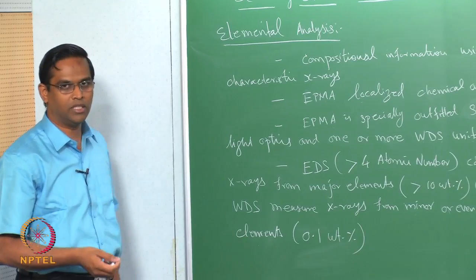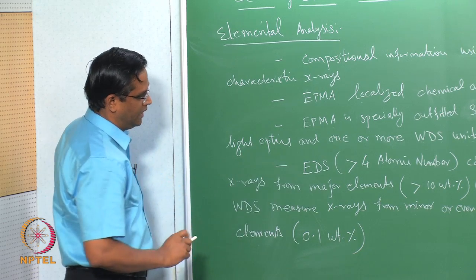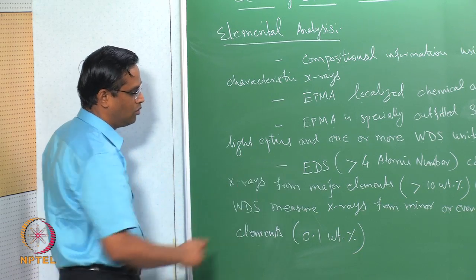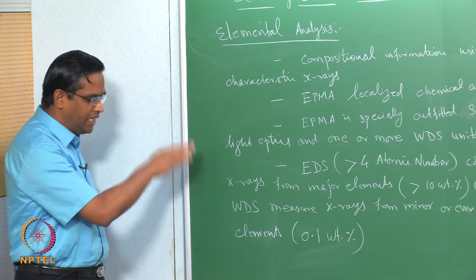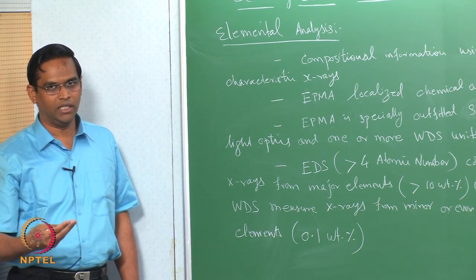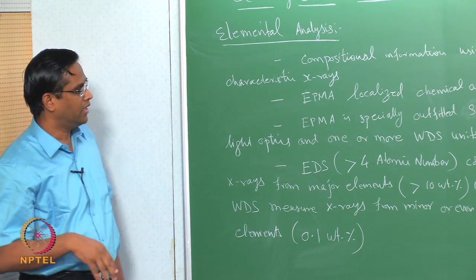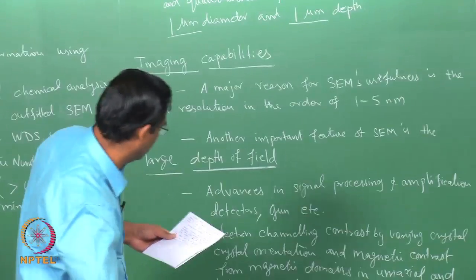So WDS is much more powerful compared to EDS. We will see why, and all these details later, but these are the basic details one should have when you look at the capabilities of a scanning electron microscope. I have a few more points to add in this segment.